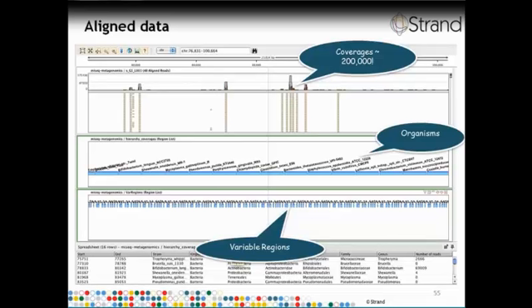And as a sanity check, we would be interested in seeing that the reads which are towards the end of the contig have mates which fall in other contigs. That could be a basis for joining these contigs into a scaffold, but those are visualizations which are not explored right now. So based on customer feedback, we will see how to incorporate support for these additional MiSeq applications into future versions of Avadis NGS.